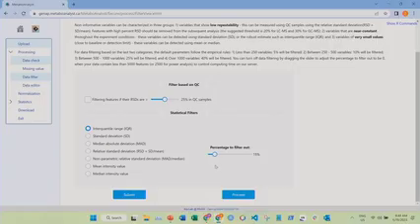And if you're doing untargeted data, this is where you would be increasing it. I would go up to 30 or 40% if I had untargeted data, but if I have targeted with a couple hundred, then I would probably not filter very many at all. It all goes back to that multiple hypothesis correction I talked about, the adjusted p-values. If we have 10,000 features, we're going to be adjusting a lot. And if we're keeping things in there that we know are garbage, then we're just performing this more intense correction for no reason. So that's why you would want to be filtering out here, because it means later on you're going to be adjusting your p-values less. That's why your statistical power increases.